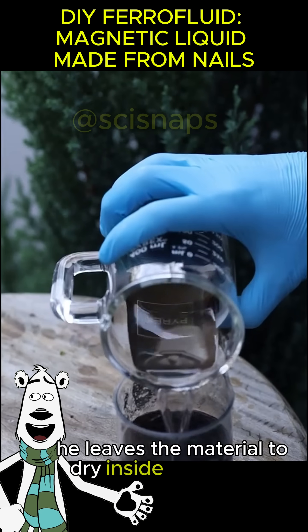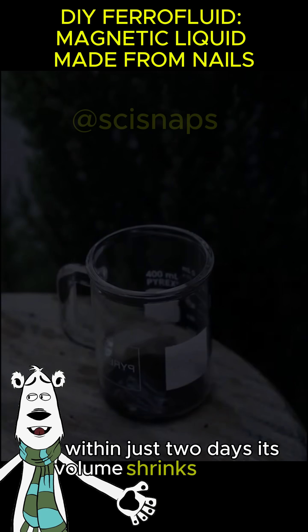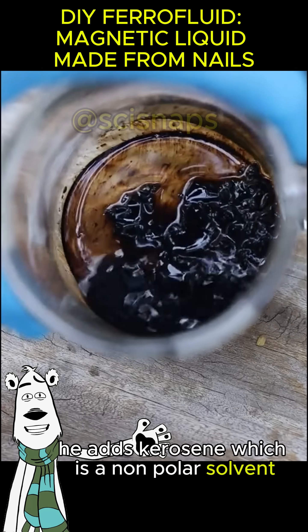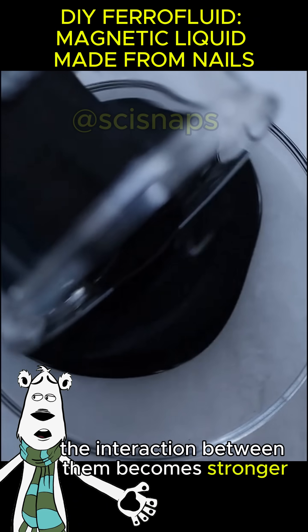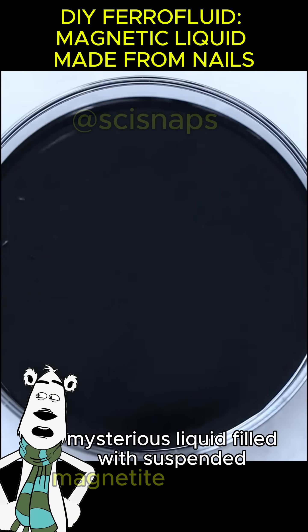After the final washes with isopropyl alcohol, he leaves the material to dry inside a glass mug. Within just two days, its volume shrinks drastically. Since the particles are now coated in oil, he adds kerosene — a non-polar solvent — because its structure is much more similar to oil, making the interaction between them stronger.